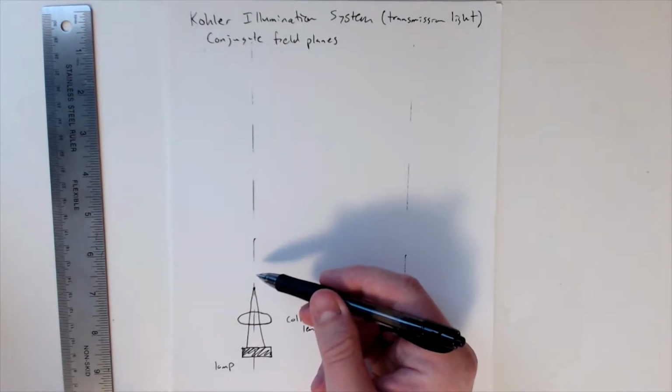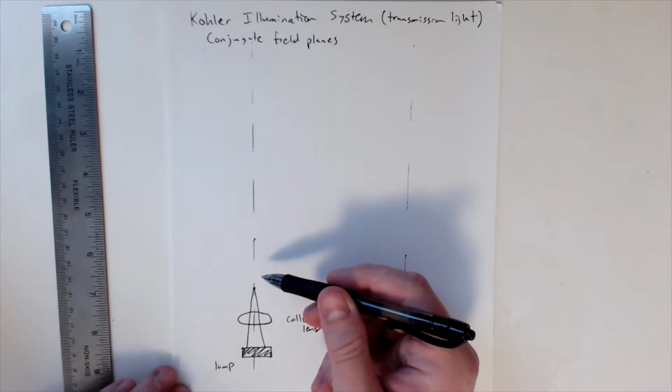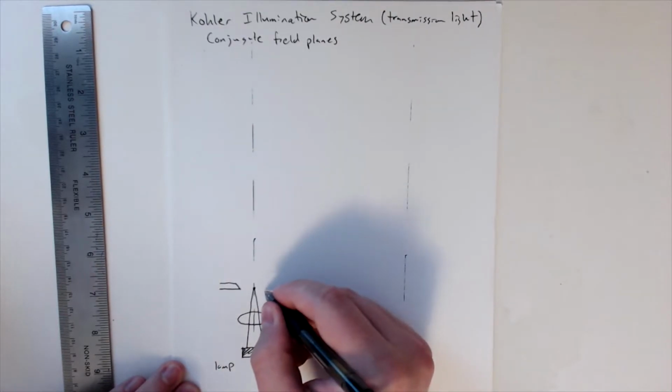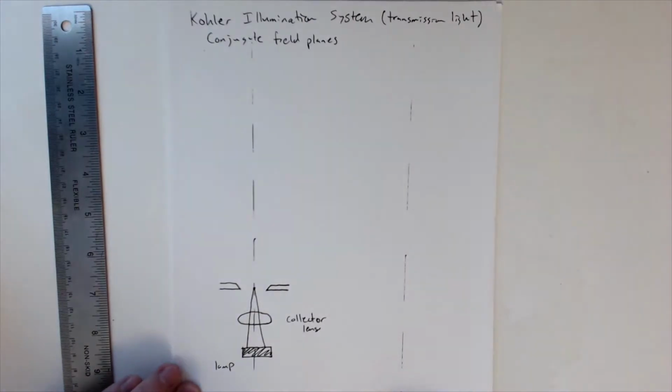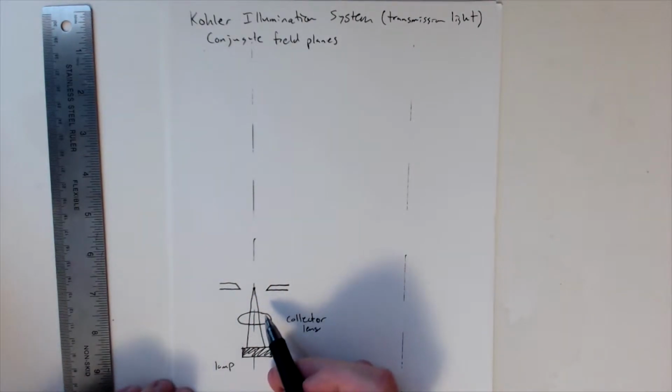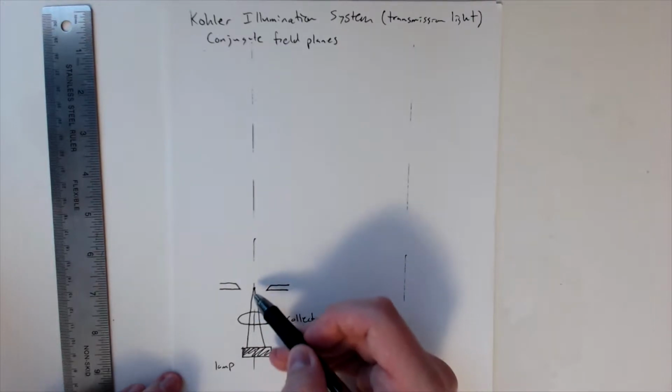So at this point, we also tend to have an aperture. I'll just draw that, but we'll come back to it in a bit. So this is how I'm drawing apertures. All right, so I'll draw it there at the focal point, but we'll come back to that. So it's converged.